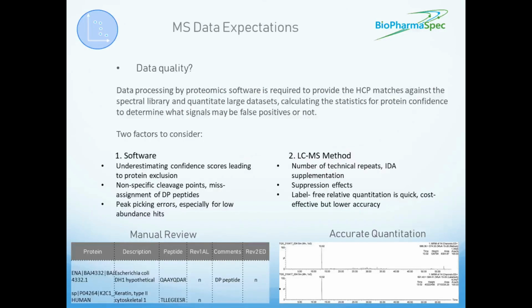It won't catch everything, in part because of the associated challenges of attempting to create and interpret data over a 5 order of magnitude sensitivity range. However, by targeting, for example, the highest intensity hits, it is possible to weed out further any false identifications that can have a significant impact on total HCP estimates. And to conclude this discussion, we wanted to emphasize also that the LC-MS method that has been selected for your analysis will dictate the data quality.